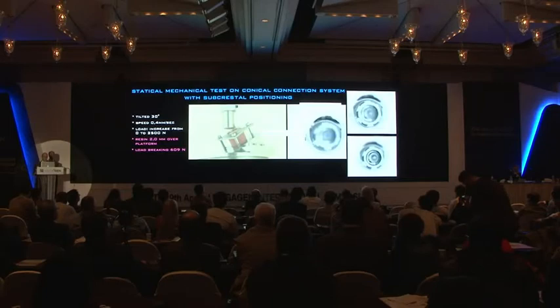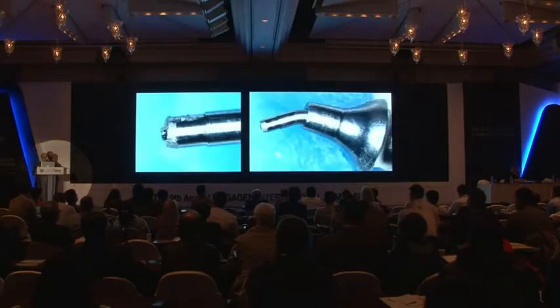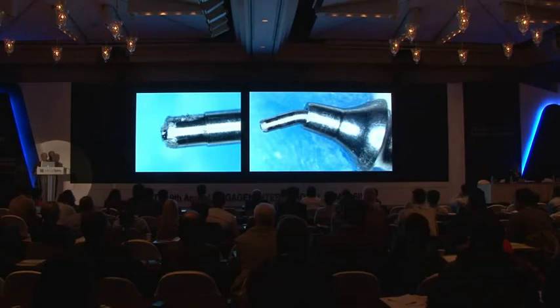And for this reason, we do not have the same deformation you see on your right in the implant diameter, as in the stereo microscope images. So it is a big difference to have bone on the platform or the implant outside the bone. And as in the previous test, the deformation is on the screw and not on the conical part of the abutment.